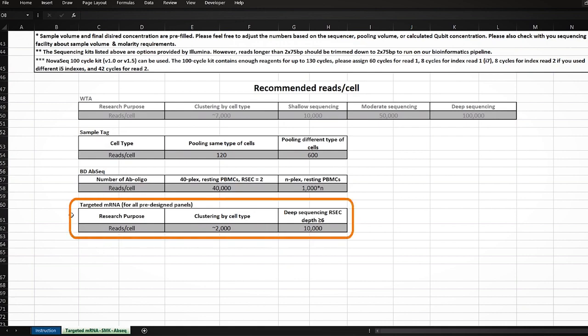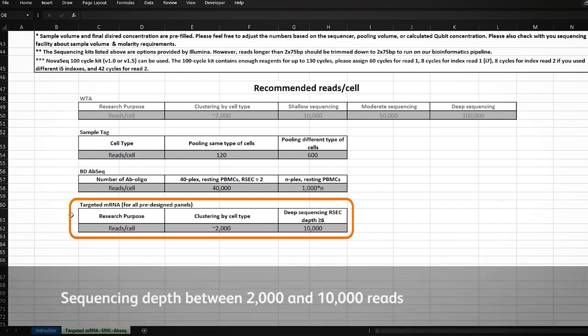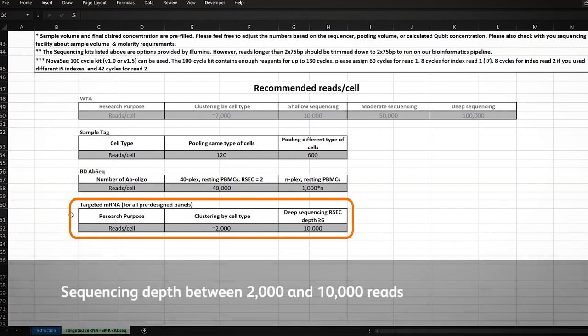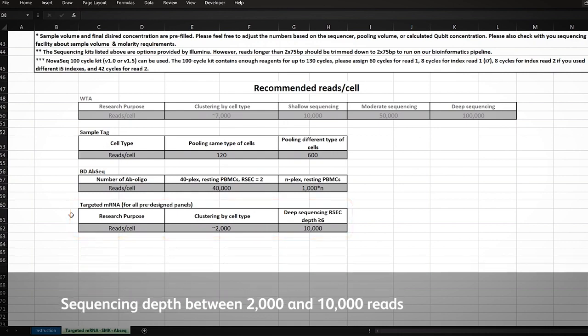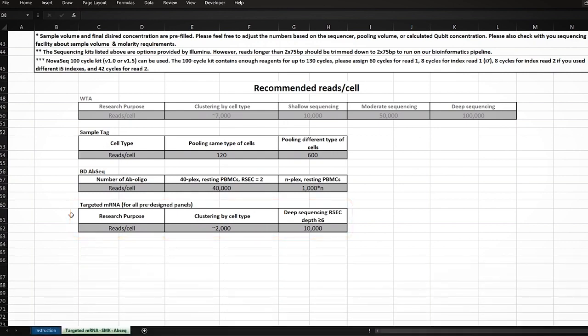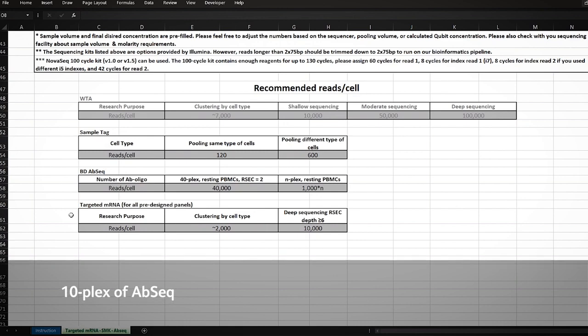Since our experiment is for a targeted mRNA assay, we will choose a sequencing depth between 2,000 and 10,000 reads per cell for the mRNA library. We additionally use a template of AbSeq antibodies and a few sample tag antibodies.